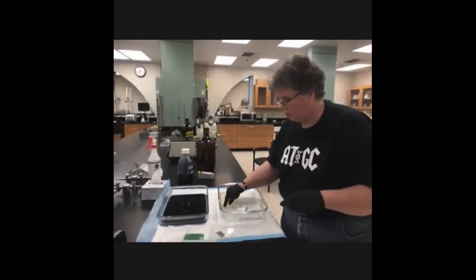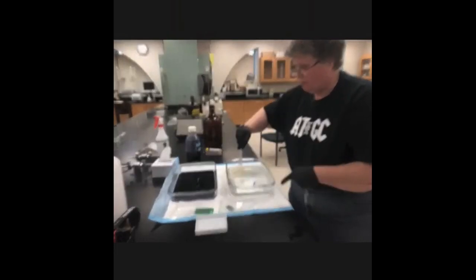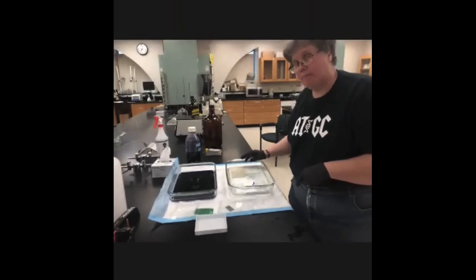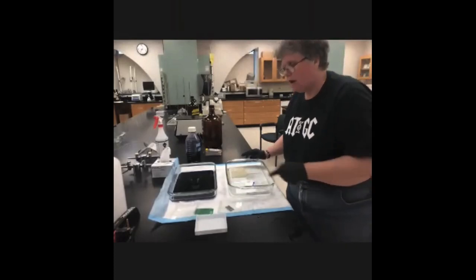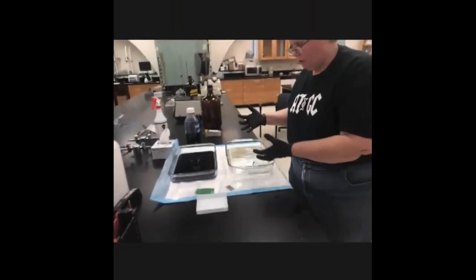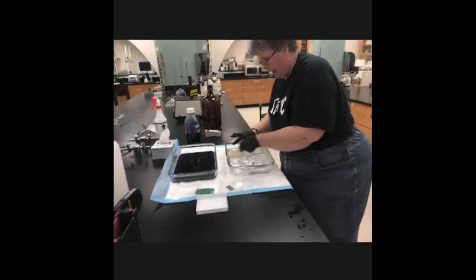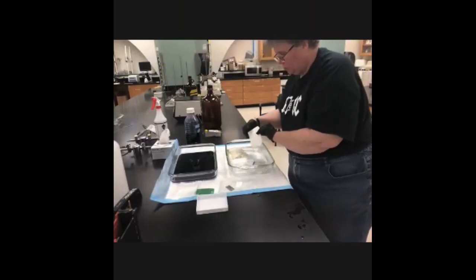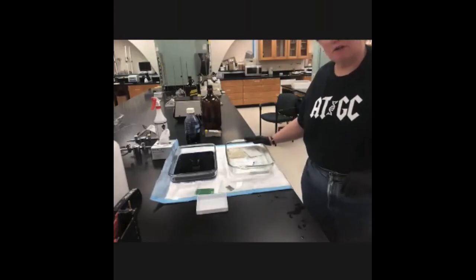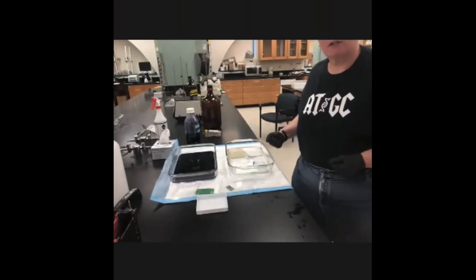In addition to the transfer buffer in the gel, also soaking in here is our PVDF membrane. You need to get it hydrated by putting it in methanol briefly first, and then you can take it out of the methanol and put it into soaking in the same transfer buffer. You also need to soak two fiber pads, and two thick pieces of paper. All of these are going to be used to make our sandwich. And as soon as our soaking period is over, you will see how we make the sandwich.